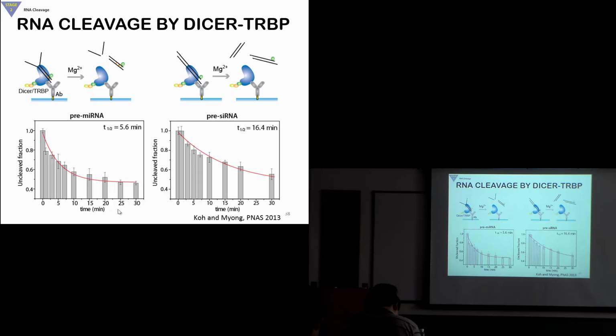It's pretty rugged and messy. It depends on who makes the slide too, but it's not that homogeneous, so that impacts signal strength sometimes. We see some differences in signals in neighboring molecules, and it can also be that the height is different and where it sits in the evanescent field is slightly different. But in most cases, our intensity histogram is pretty sharp, so we think it's okay.